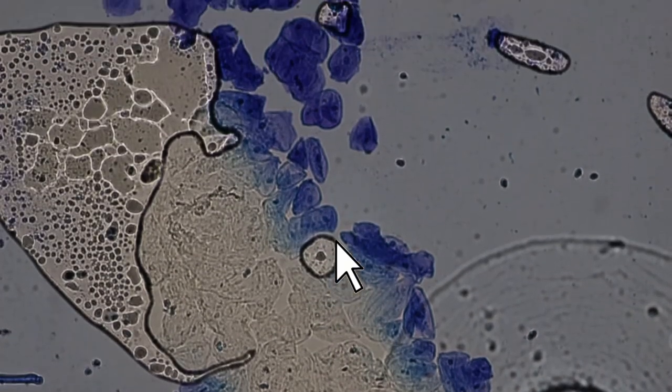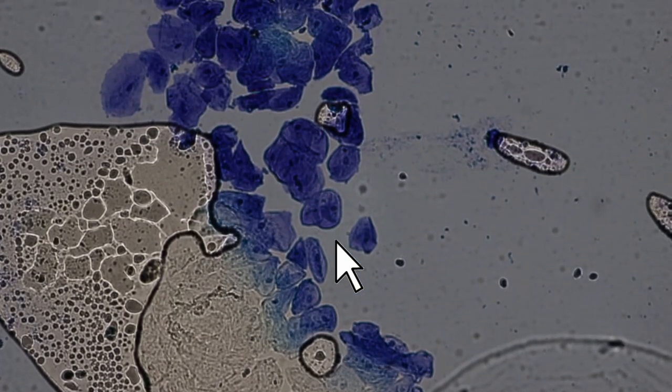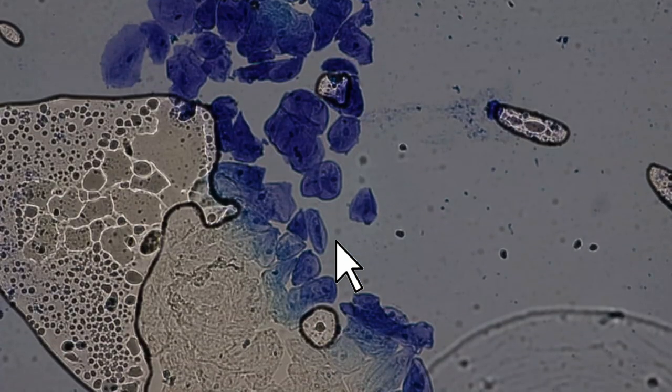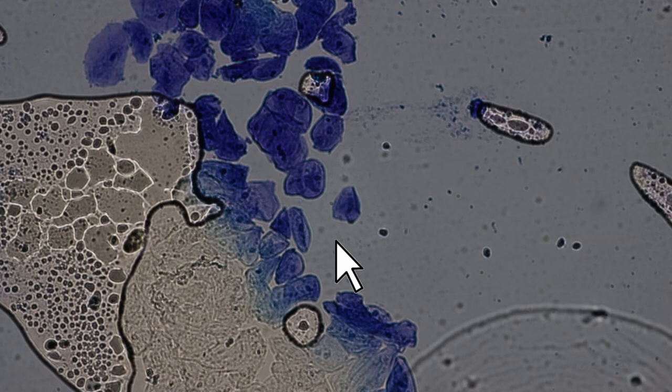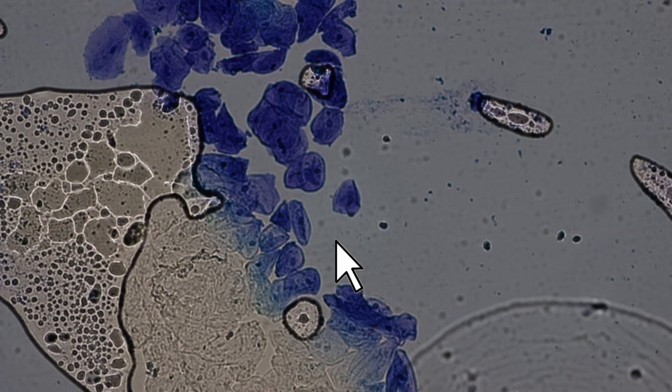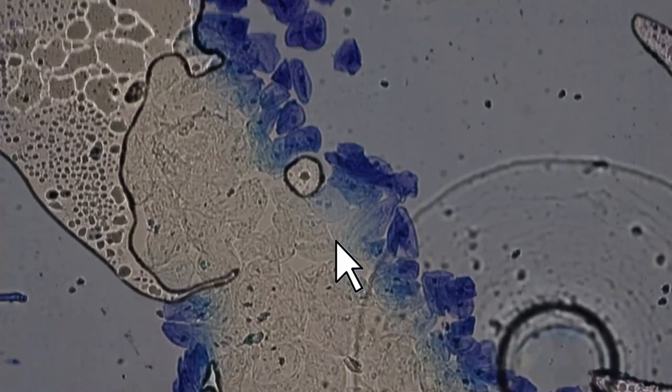So again, even at the risk of repeating myself, the principle here is that the cells that you want to stain start to build up the stain and become darker than the surrounding. If you use concentrated methylene blue, everything's going to be dark blue, and you will not be able to see the contrast quite nicely.